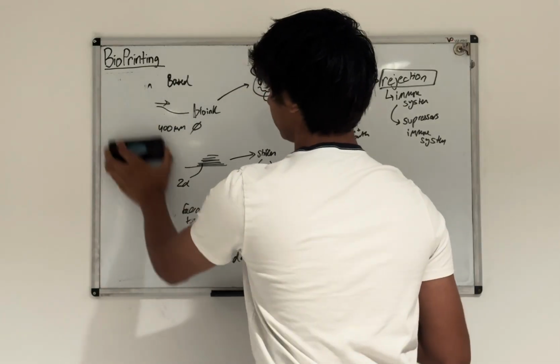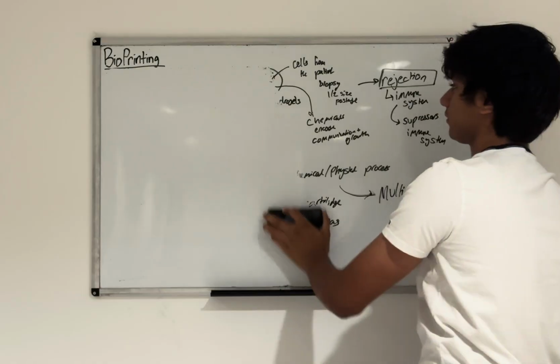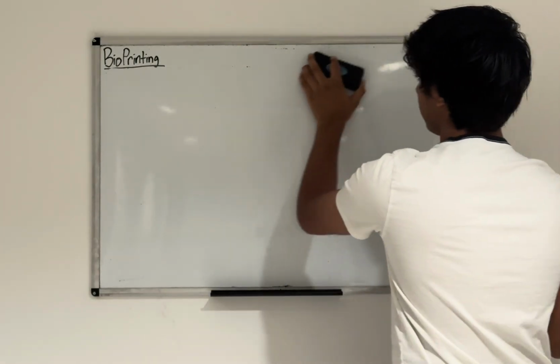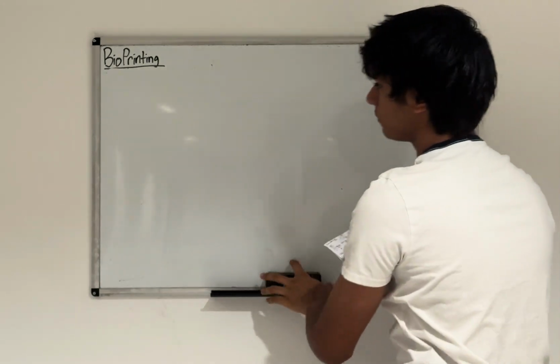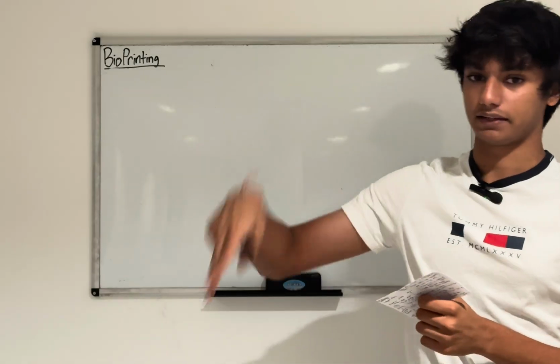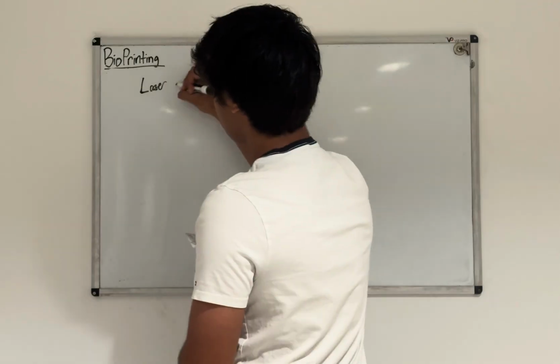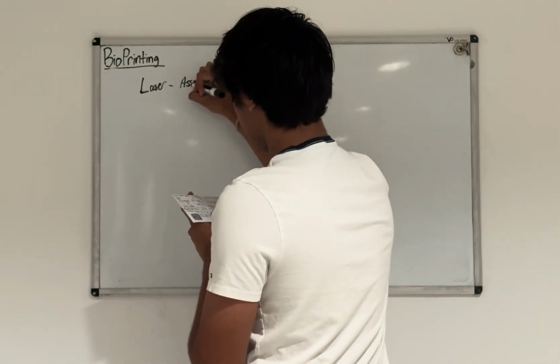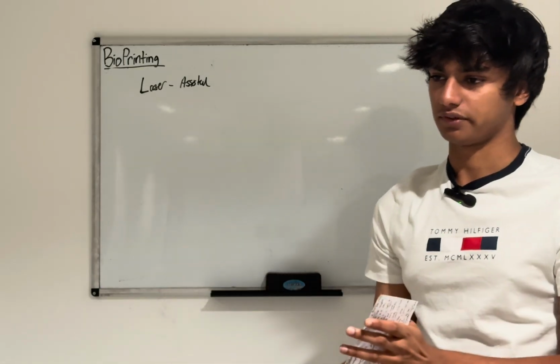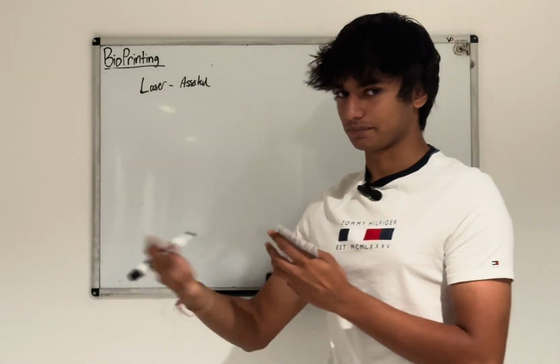And extrusion-based printing isn't the only method being researched right now. It is the main one that people are focusing on, but there are other methods. There's inkjet, that's the earlier method I was talking about. Inkjet isn't really used that much anymore because it's a little less accurate, because it uses blobs of ink rather than a continuous stream. And there's also laser-assisted printing, which uses laser pulses to guide droplets and to guide the bioink into certain positions. This is more accurate, but it is still being researched and still a work in progress.